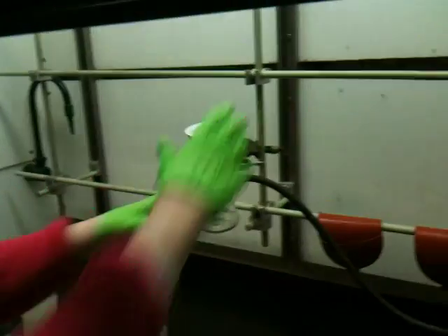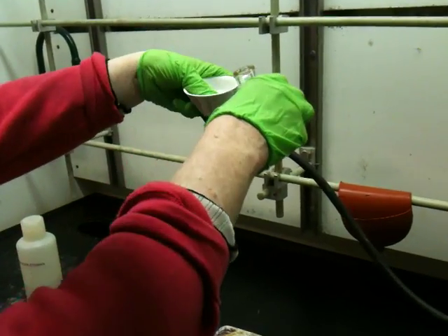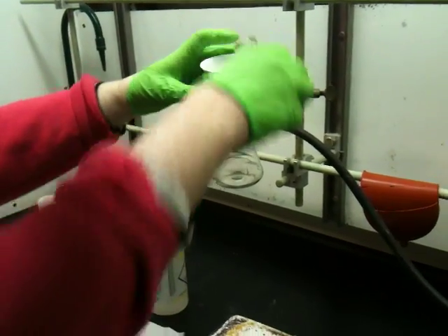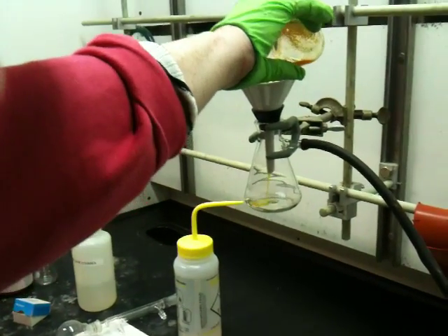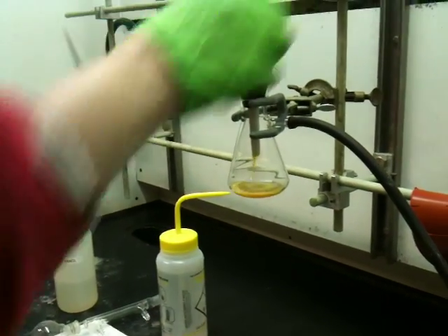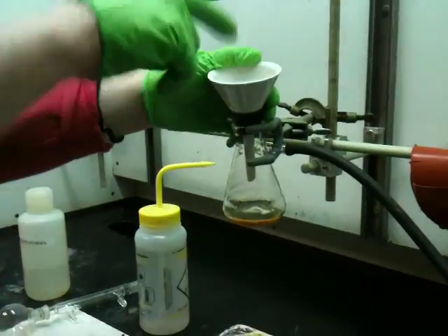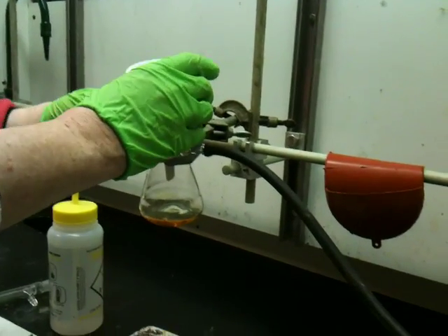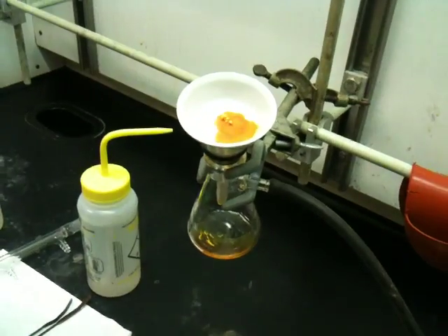I'm going to vacuum filter this. Make sure the paper's covering the hole and the vacuum is on, then pour it through. The crystals are very orange, as you can see, because there was excess bromine in there.